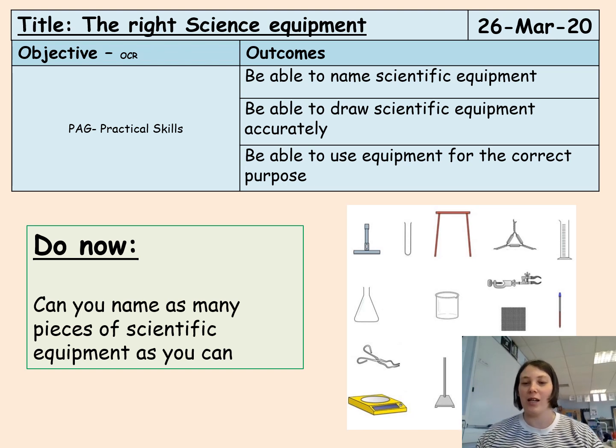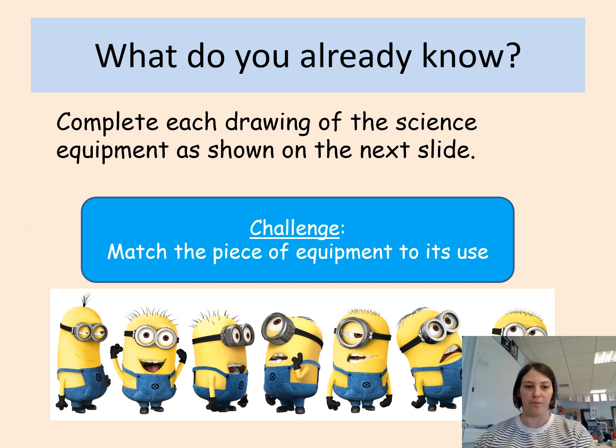Hello Year 7 and Year 8, it's Missy Hughes again presenting your practical skills lesson on the right science equipment. By the end of this lesson you're going to be able to name the scientific equipment, draw the scientific equipment and use the equipment for the correct purpose.